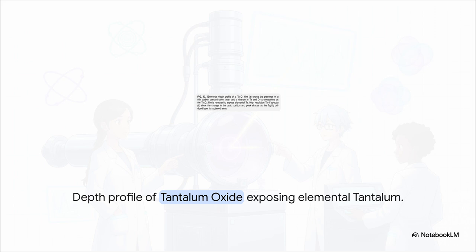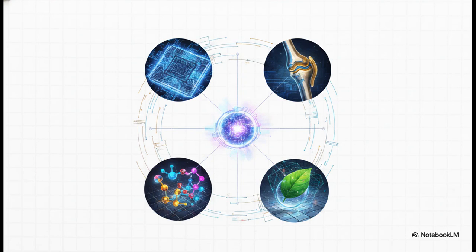This exact capability is absolutely vital for designing and characterizing the incredibly thin films used in the semiconductor devices powering the smartphone or computer you are using right now. Because surface properties entirely dictate how materials interact with their environment, XPS applications are just everywhere.